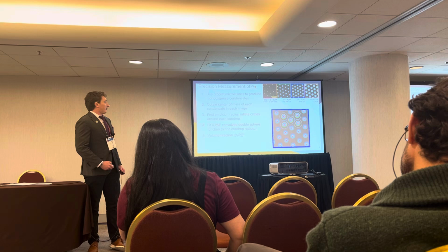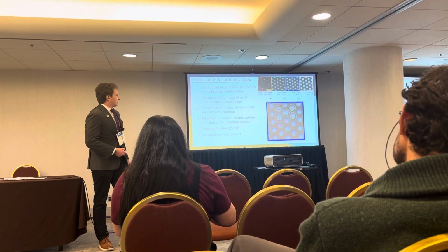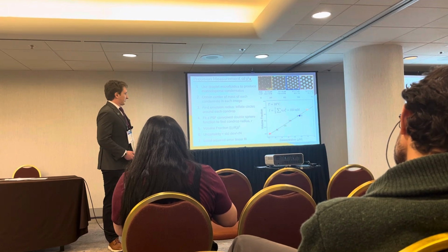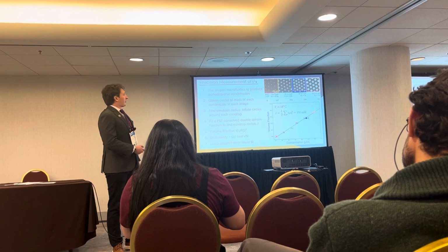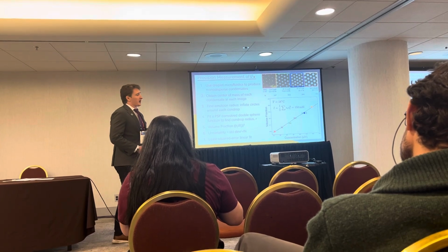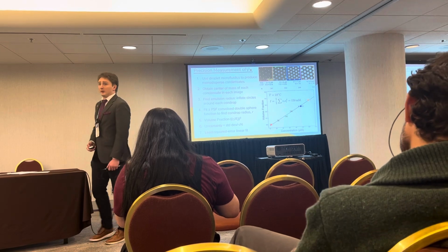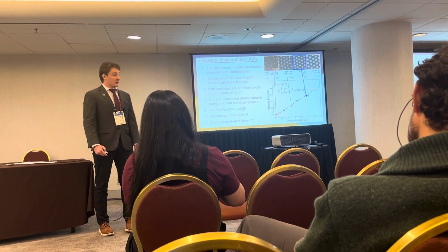From there, of course, we were able to compute a volume fraction, and due to the large number of emulsions within each sample, we got away with using the standard error to report the error in our volume fraction. And then we performed a least squares linear fit. For example, this data was taken at 18 degrees Celsius and an ionic strength of 150 millimolar, and to me, that looks fairly linear. And indeed, you'll notice that the colors of the dots correspond to the raw data you are actually looking at the moment.